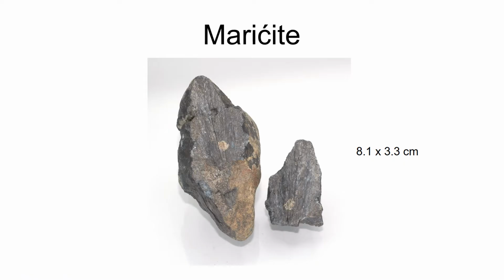So the first mineral we will talk about found at Little Fish River is marićite, probably one of the most prolific of the species of phosphates. The most common mode of occurrence was in nodules where marićite makes up most of the nodule, as seen here, as sprays of marićite crystals. These sprays tend to have a duller luster. They tend to be broad. In this particular sample, in the lower portion of it, there's also some ludlamite as well as a spot of pyrite seen in the middle portion.